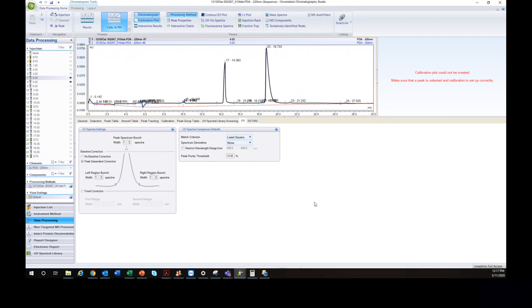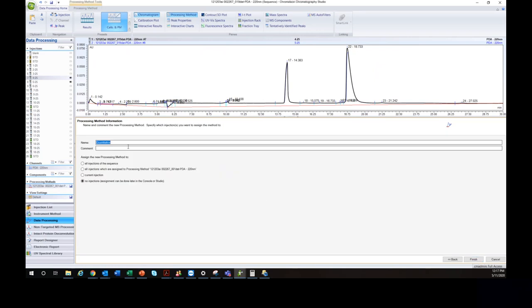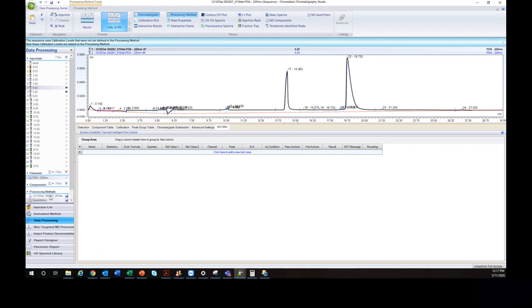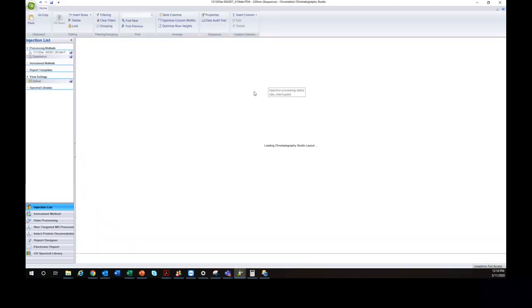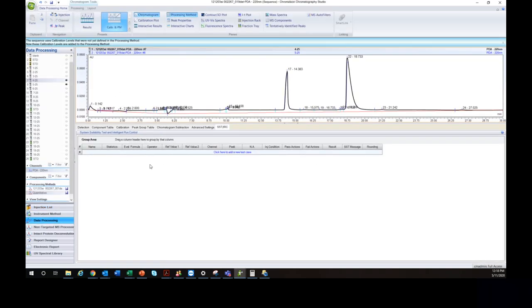To create a processing method, click the Charlie icon, go to New, and select New Processing Method. Choose quantitative unless you're doing 3D quantitative or mass spec work. Click Next, optionally rename it, and apply it to all injections in the sequence, then click Finish. You'll now see two processing methods in the processing method tab — Quantitative is the one actively being used, and the injection list confirms it will be used in final calculations.